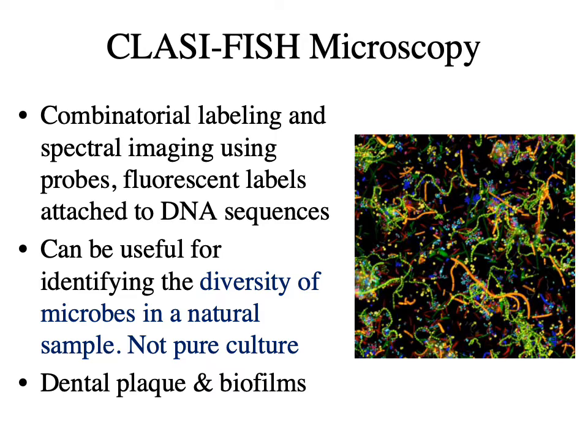CLASI-FISH is a relatively new type of microscopy. What it can do is give you a snapshot of the environment of the sample that you have collected. It is not a pure culture. It is the diversity of all the microbes in a natural type of sample.